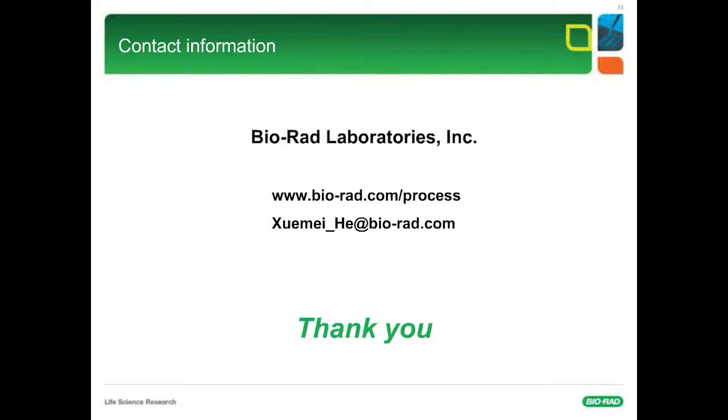And in your experience with the resin, what percent of the time do you think we would have to resort to an additive, like in the case of C prime and some others you use? Do you notice a difference in the number of times you have to use an additive to get proper elution? Well, I would say from my own experience, it's about 10%. So for the majority of the cases, you don't have to, even for IgM molecules, the aggregates were removed without using any additives.